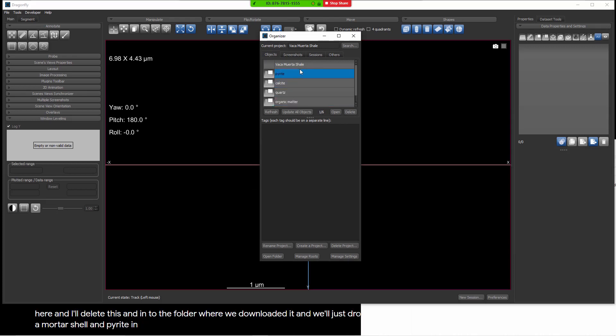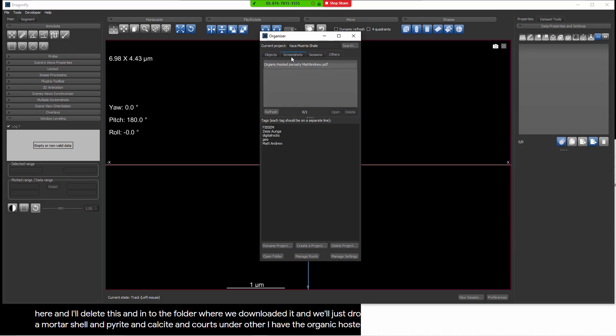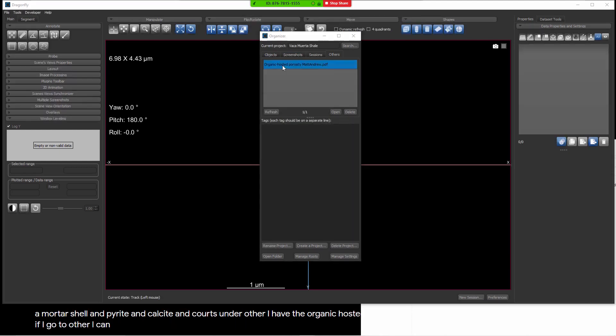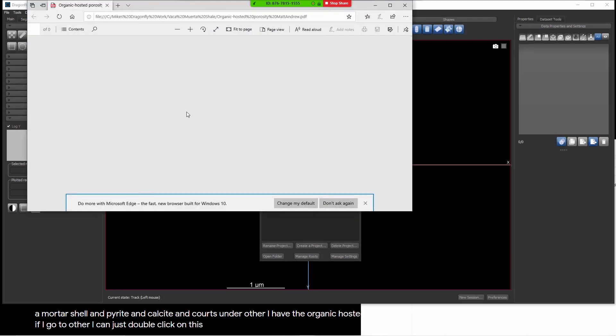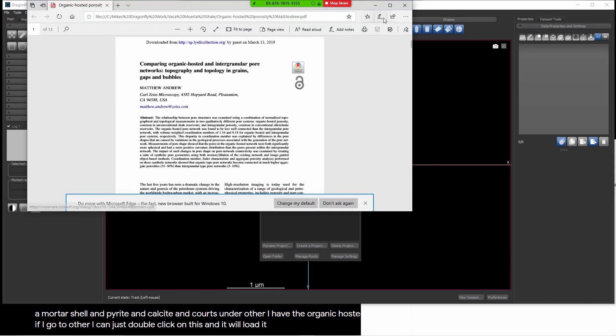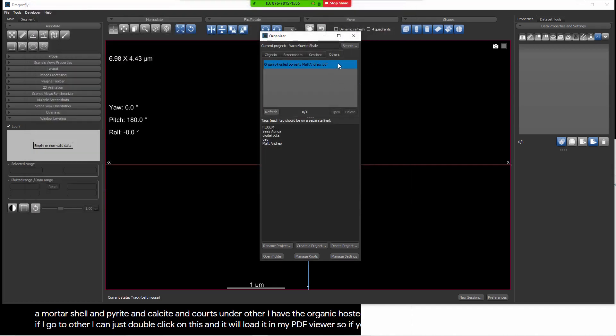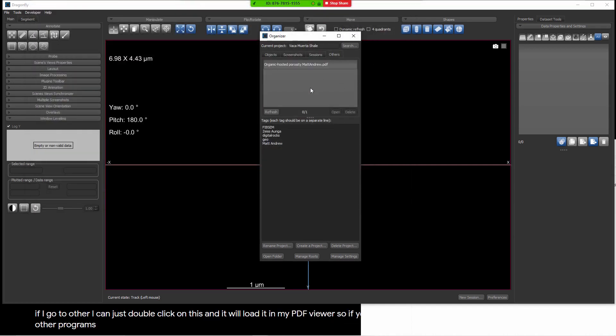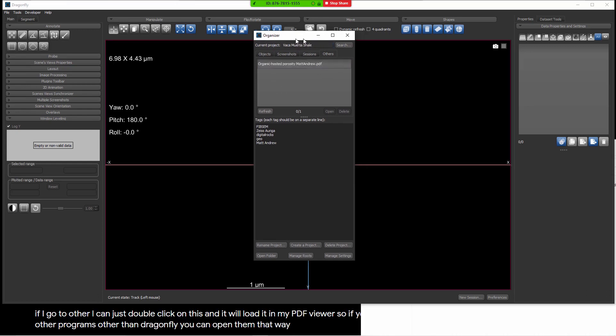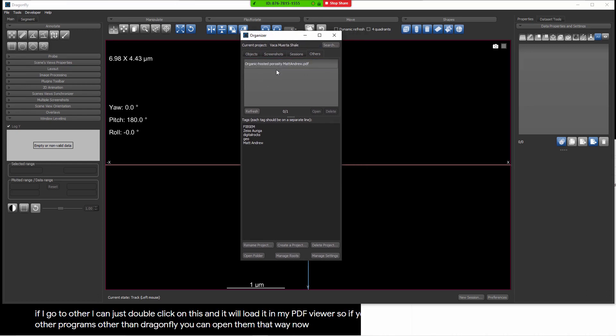And now what you see is under objects, I have Vaca Muerta Shale, and Pyrite, and Calcite, and Quartz. Under other, I have the organic hosted porosity. That means anytime I'm looking at this project, if I go to other, I can just double click on this and it will load it in my PDF viewer. So if you have other data objects that are associated with other programs other than Dragonfly, you can open them that way. Now, what we're looking at at this point is just a single project. Let's create a second project.